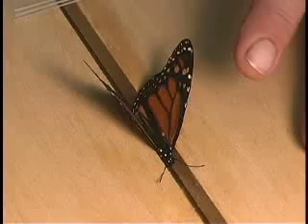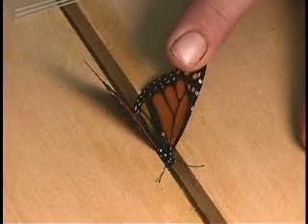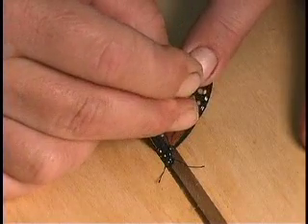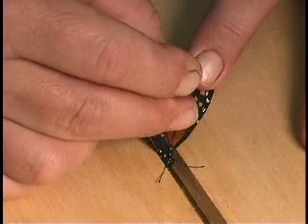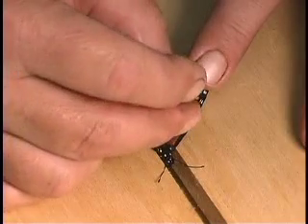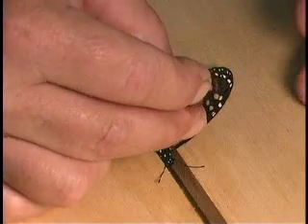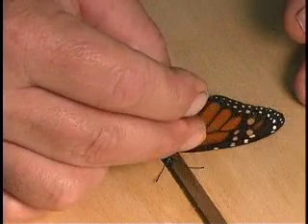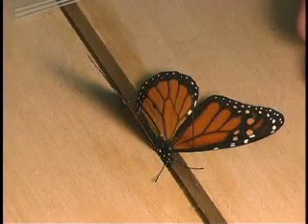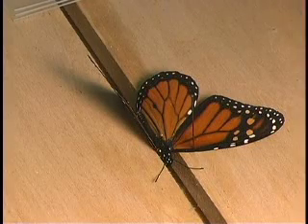Remember, on all Lepidoptera, the costal vein is the strongest vein on the wing, and you need to position the pin either in or slightly below the costal vein, fairly close to the apex of the thorax. Once that is done, then gently pull the wing forward, just part way, and insert the pin into the pinning board to hold that wing in place.